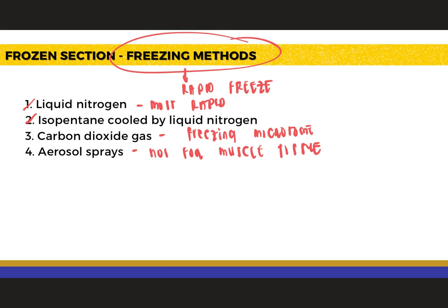First, soft tissue is liable to crack due to the rapid expansion of the ice within the tissue, producing ice crystals or freeze artifacts. Please take note that overcooled urgent biopsy blocks will cause damage to both block and blade of the microtome if sectioning is done at -70 degrees Celsius or below.